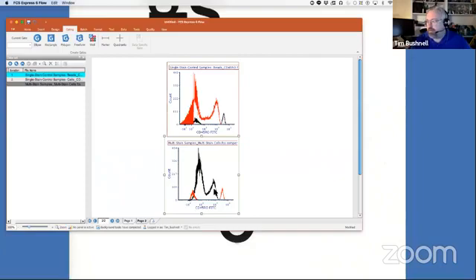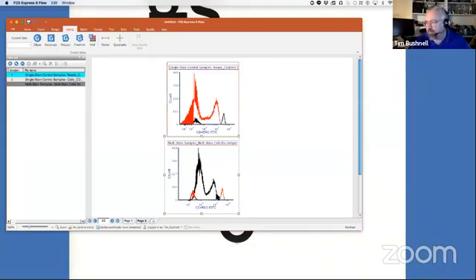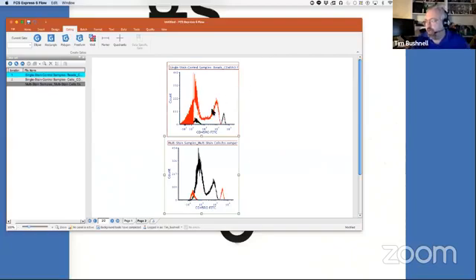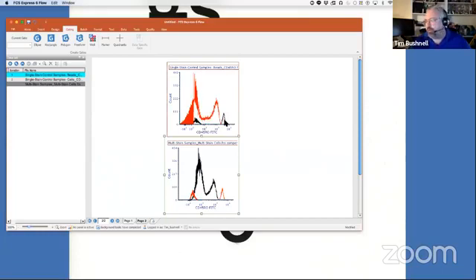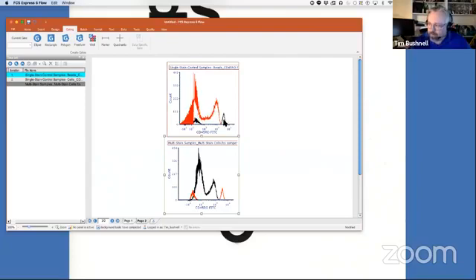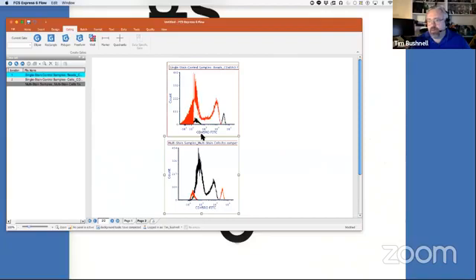We've made, when we were going to set compensation, we would be using this positive and negative. You'll notice there's a positive and negative in both of my controls so that I can gate on both of these. The reason beads are also nice is it's very easy to gate here on the positive with the beads because we have very good separation, whereas with the cells, where do we actually draw our gate? So that helps with our second rule and our third rule.